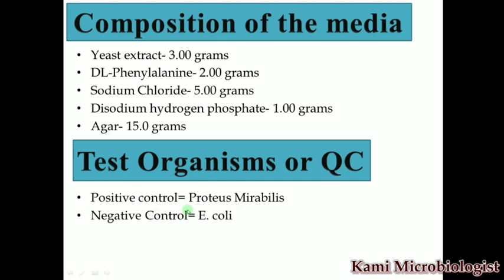coli, that is acting as a negative. Okay, so these two things you have, two things, these two bacteria. And once you have these two bacteria, then you will also perform your test, and with the positive and negative control you will check the quality of the media.